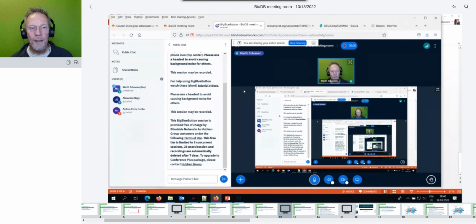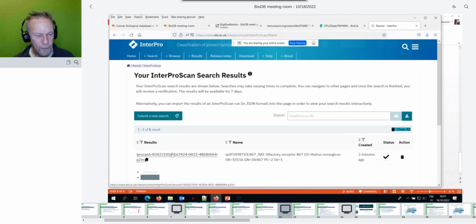Let's see if our search results are there. Okay, done in less than 2 minutes. Now, where are the results? Here.